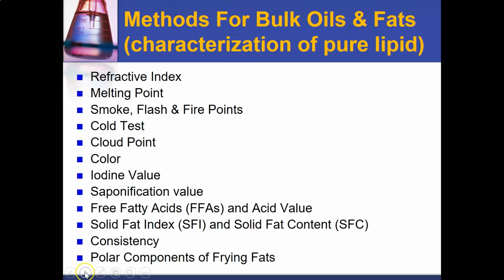So you can determine the refractive index, melting point, smoke, flash and fire points, cold test, cloud point, color, iodine value, saponification value, free fatty acid and acid value, solid fat index and solid fat content, consistency, and polar components of frying fat.